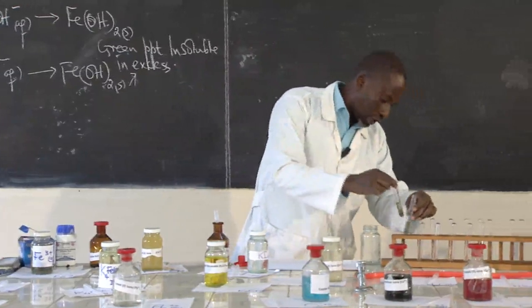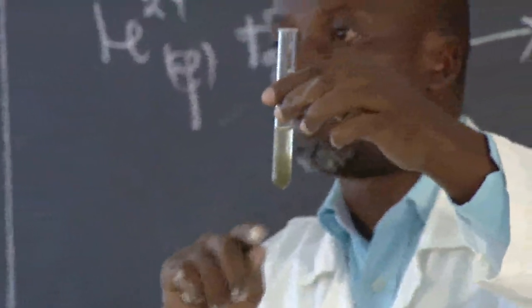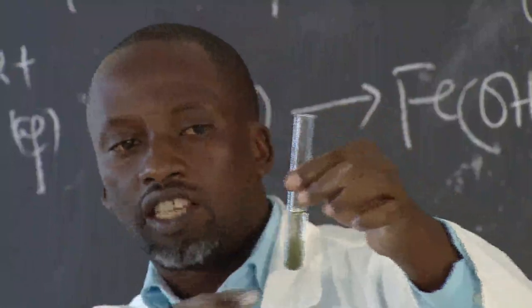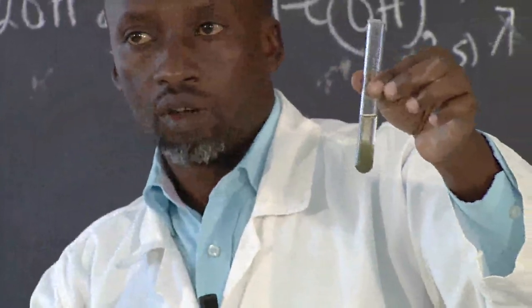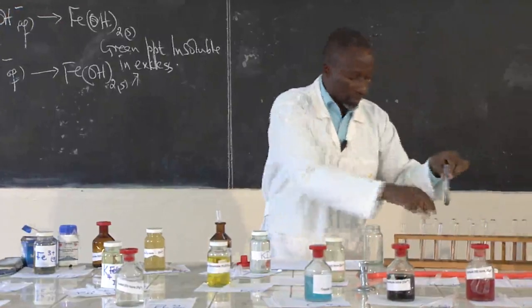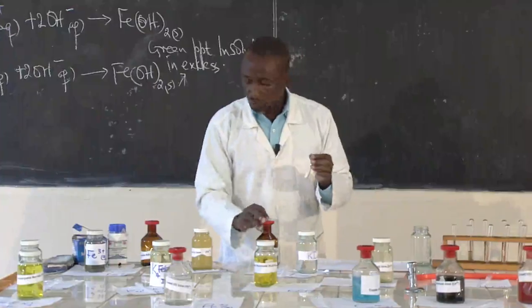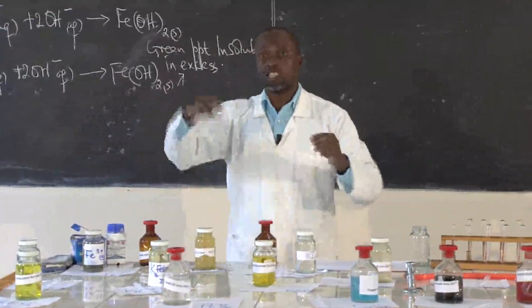Let's see what happens later. As I said earlier, iron 2 easily changes to iron 3. On standing, the dirty green precipitate is turning to brown. Why is it turning to brown? Because it is changing to iron 3 hydroxide. That is because of aerial oxidation. So we are just going to do the same with iron 3 to see the difference.